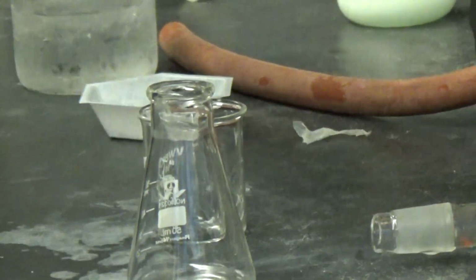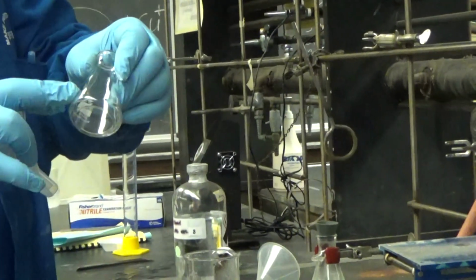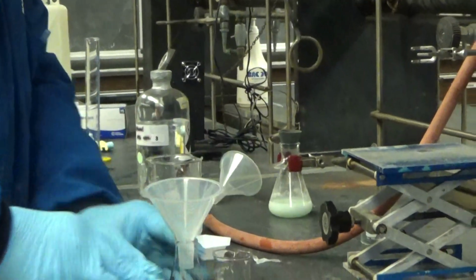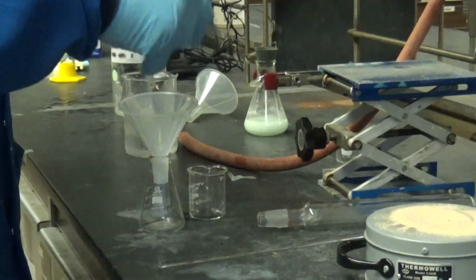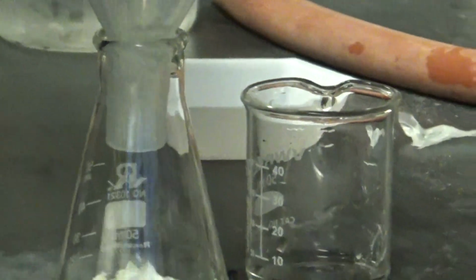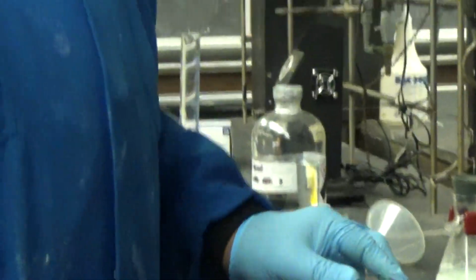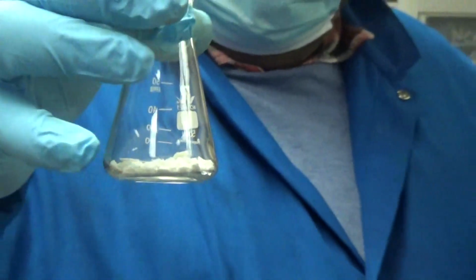You never go to a hot plate if you don't have all what you need. Okay, there's your material to purify in the Erlenmeyer flask. It's pretty nice, white crystals. But you cannot go to a hot plate now.